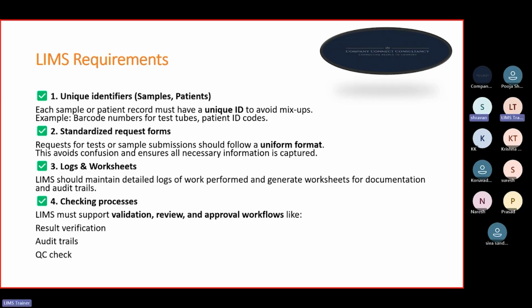You need to explain the requirement to the developer. The developer will develop that software, or the customization if there is any, and then you need to test that customization to see if it is working as expected. Based upon that, we need to enter the master data and test it. So all this role comes under the consultant only.